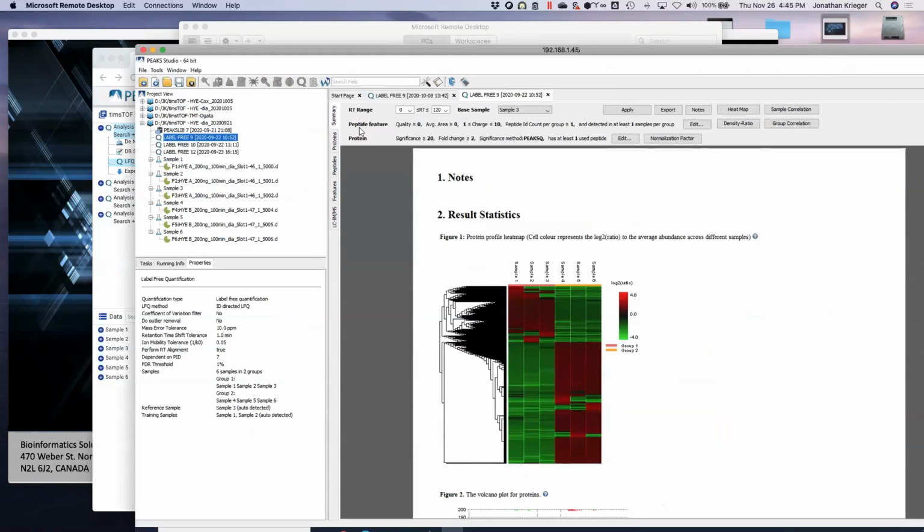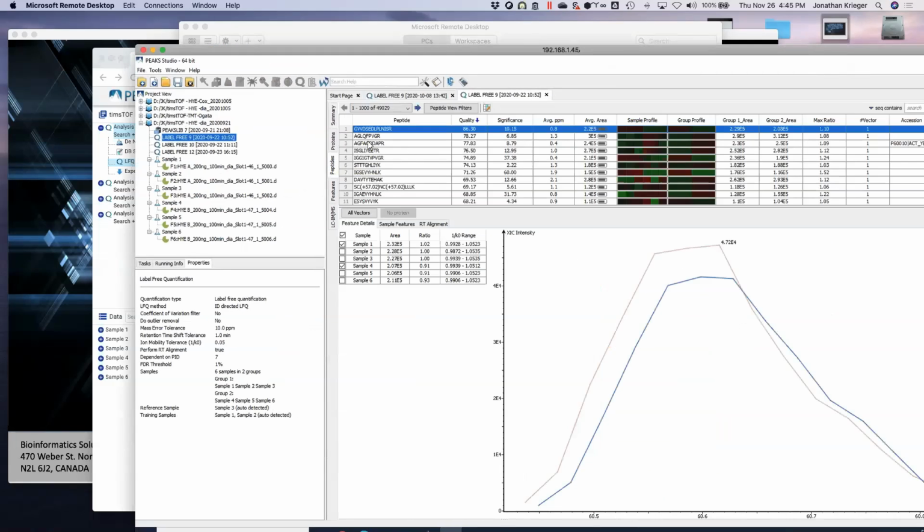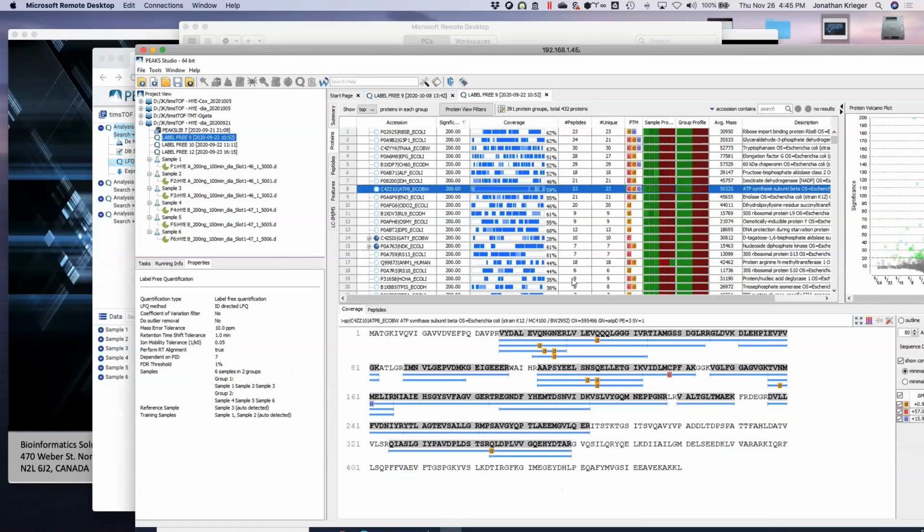So this is now opened. Let's hope that was the issue.